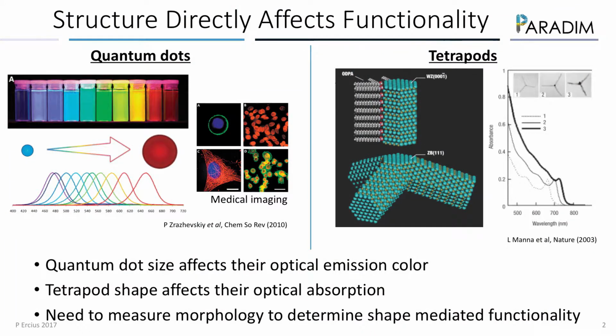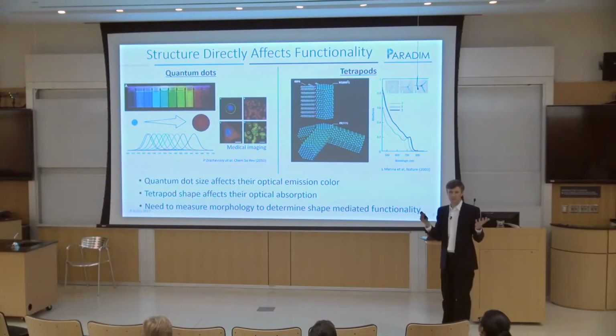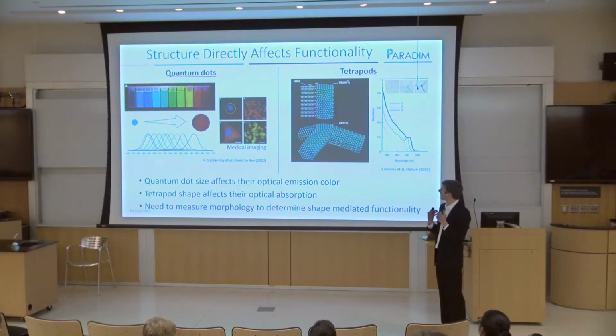Okay, so why do we want to know? Why are we taking these pictures of all of these objects at high resolution? What are we trying to do here? I'm taking a step back here to try to motivate why we want to see things in 3 dimensions. We already have these really great microscopes that can take beautiful pictures at high resolution. We can see atoms. We can see where everything is. So what's missing? What's left to do, right?